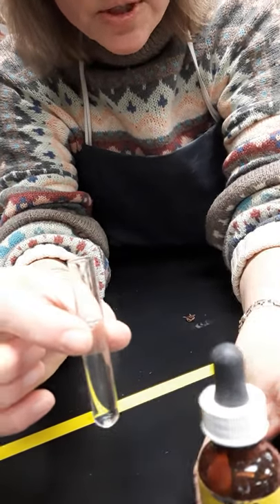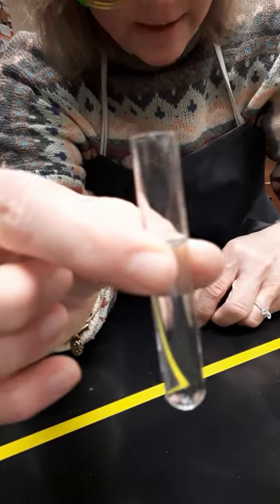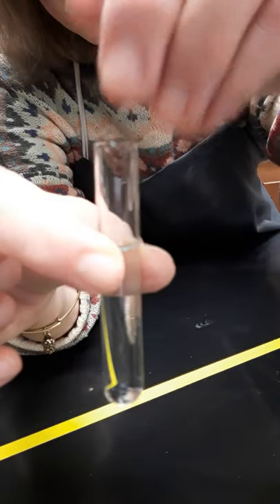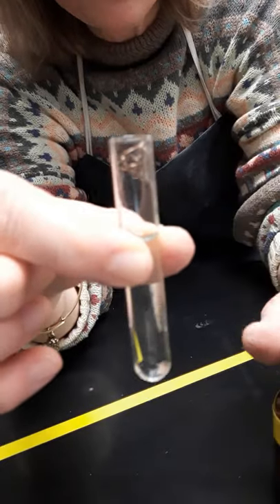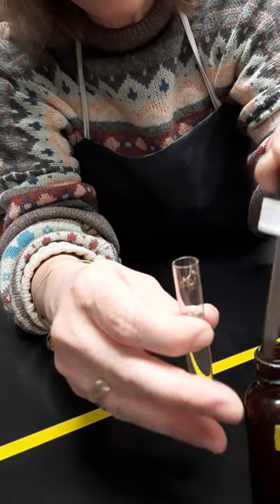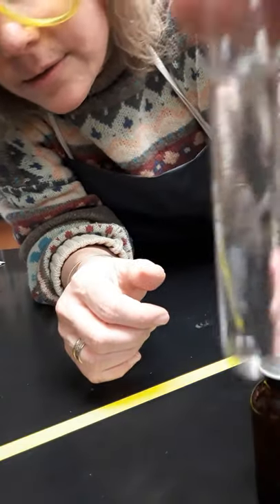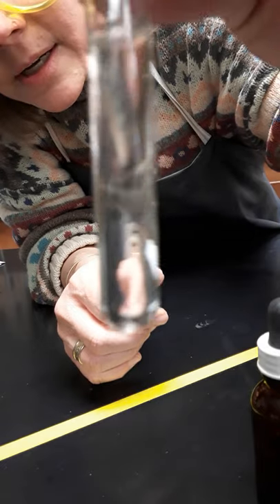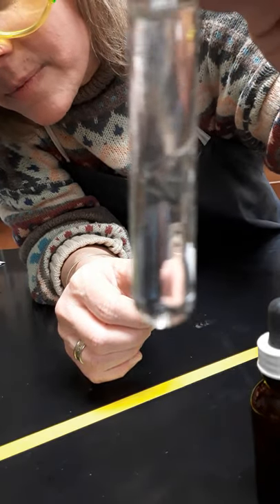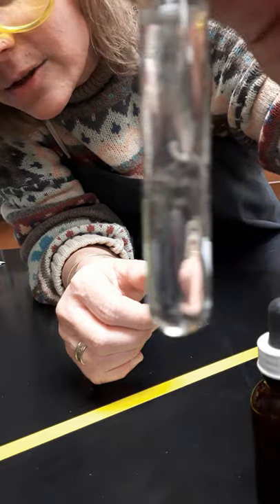For reaction number two, I'm supposed to fill a small test tube with some silver nitrate solution. That's what I've done here. I've twisted a copper wire into a spring shape — that was the best I could do — and now I'm going to drop it into my test tube. There is my copper inside the test tube, and we're going to come back and take a look at that in a few minutes.